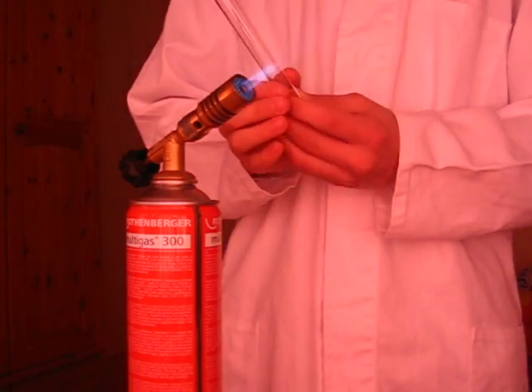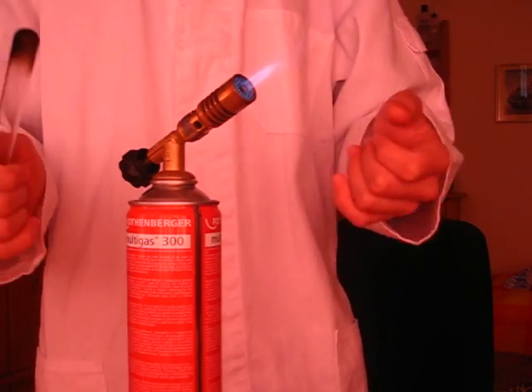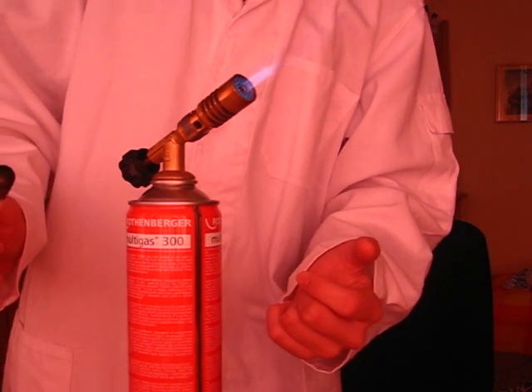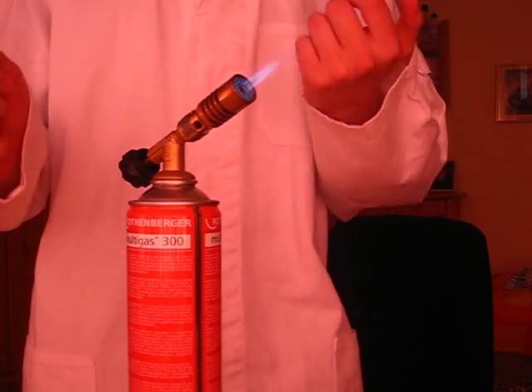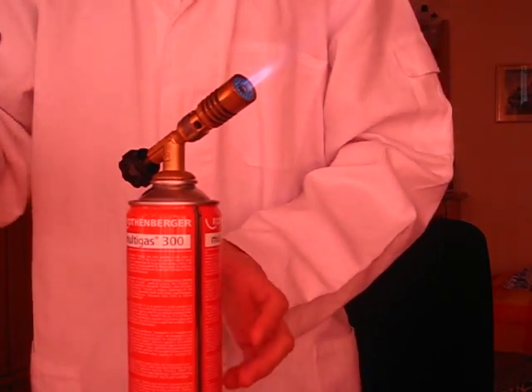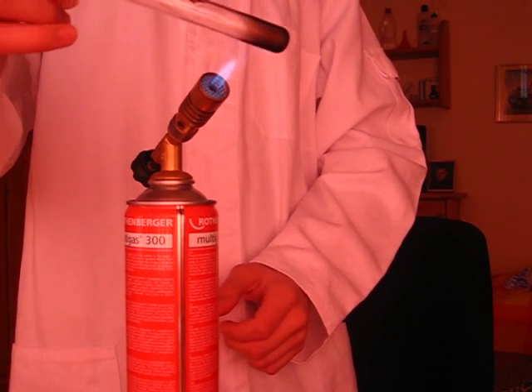Now this flame has two cones. This cone here is the reduction cone. There the gas is reduced to carbon monoxide and hydrogen. And this zone here, the blue zone, which is mostly invisible, is the oxidation zone. And I'll show you what I can do with that now. So I take the test tube and hold it in the flame.